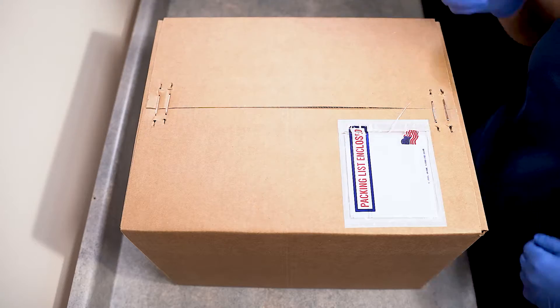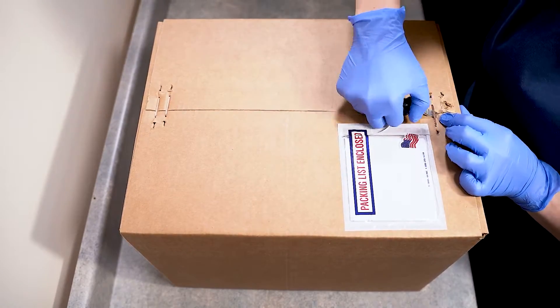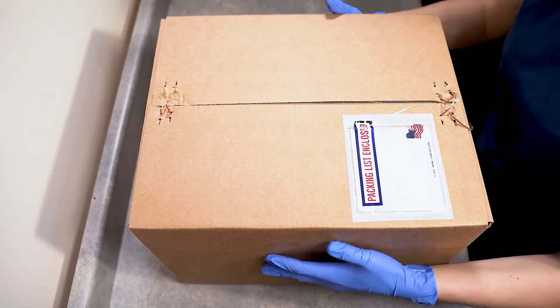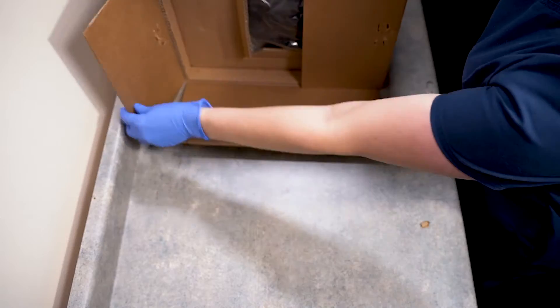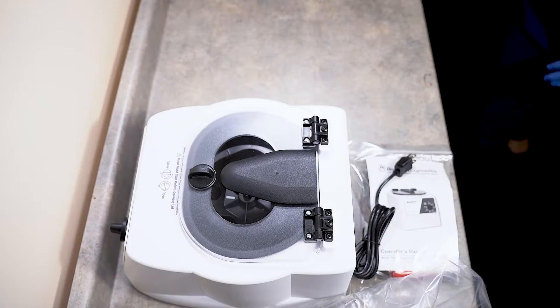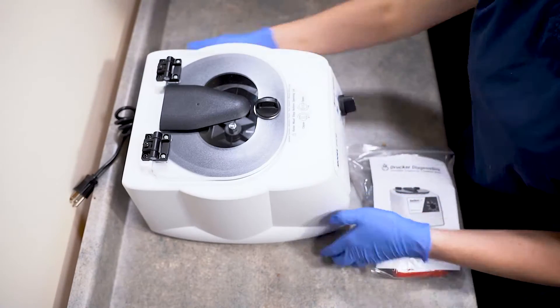Your 642B will arrive packaged from Drucker's factory. To unbox it, you will need a flathead screwdriver like the one shown here. Use the flathead screwdriver to release the staples that are holding your box closed. Once the box is open, you will be able to lift your centrifuge out. You will have your centrifuge, the attached cord, and an accessories bag all together in the box.